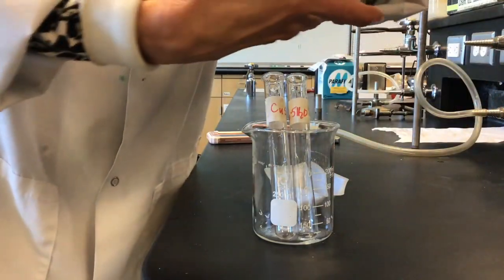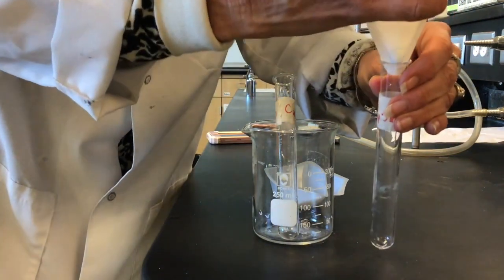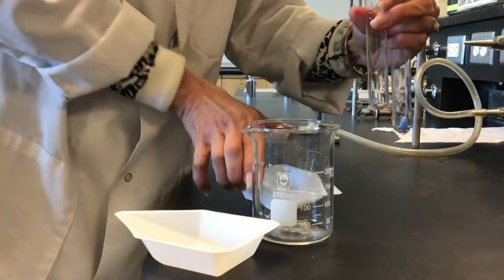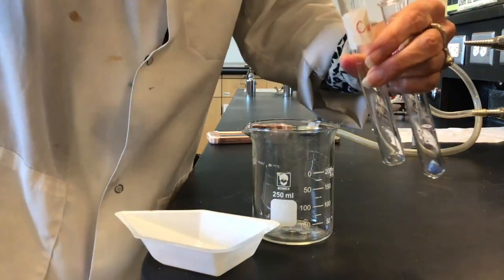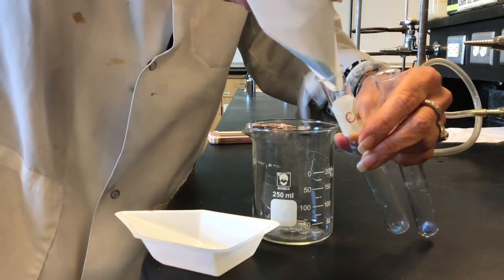Now I'm going to add my copper sulfate pentahydrate to each of the test tubes. So here's my large crystal. And then the other one has the same exact mass, but it is the powdered copper sulfate pentahydrate.